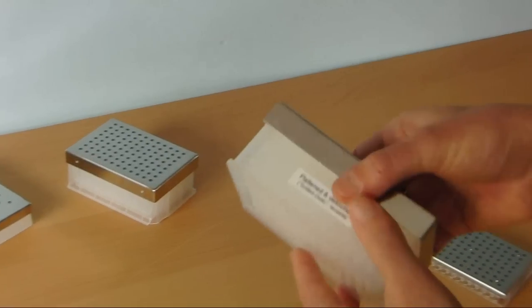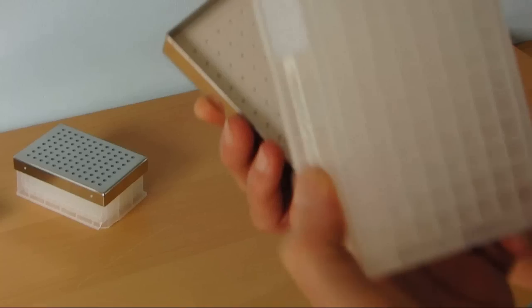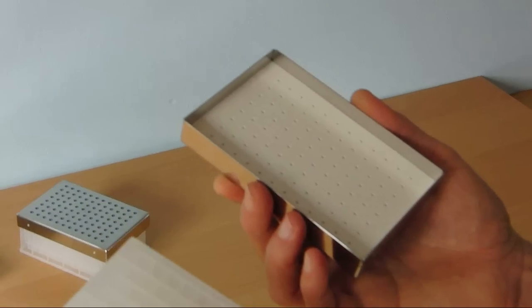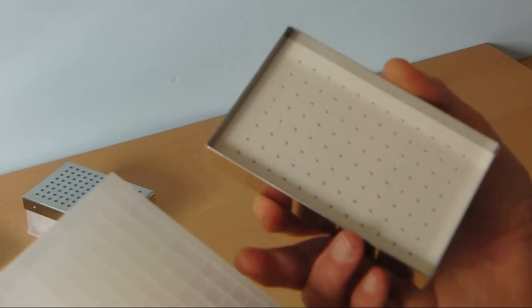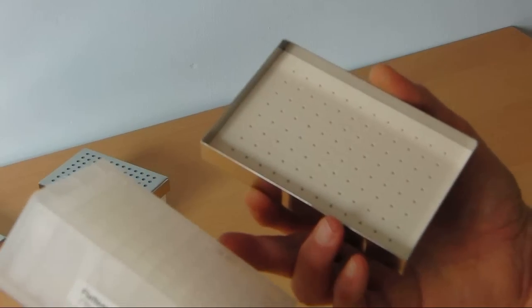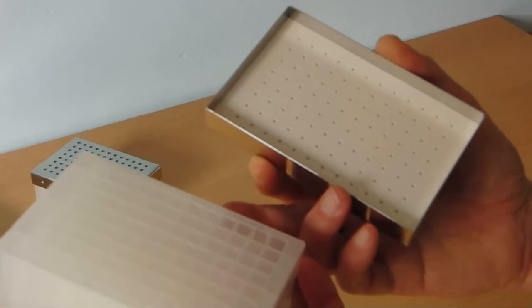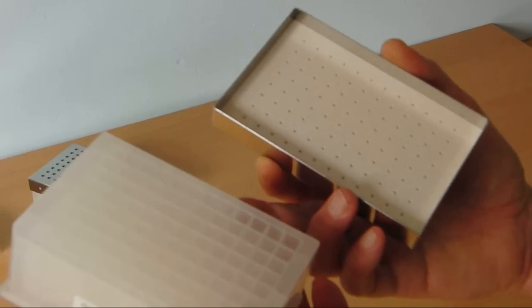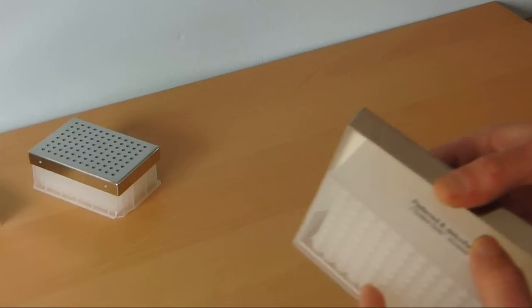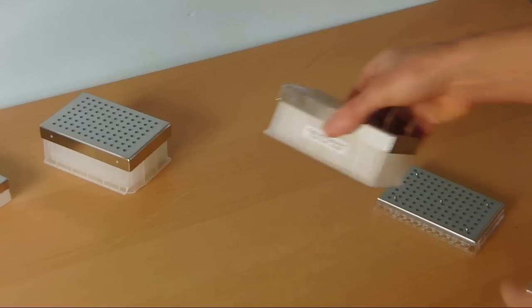We also have sandwich covers for 96 well microtiter plates. They are meant for reusable polypropylene deep well plates, which we supply as well, flattened and detoxified. These sandwich covers are compatible with all types of 96 deep well microtiter plates commercially available.